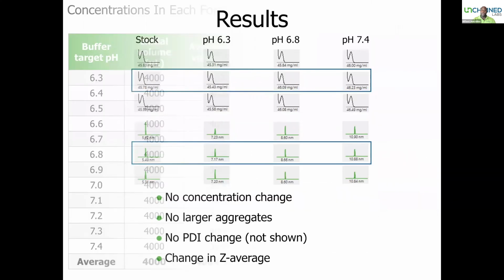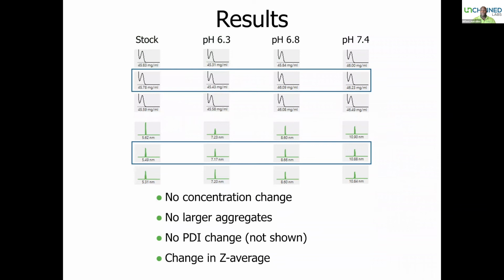So we then took those samples and we characterized them using the Stunner. As a reminder, the Stunner measures both concentration and DLS.